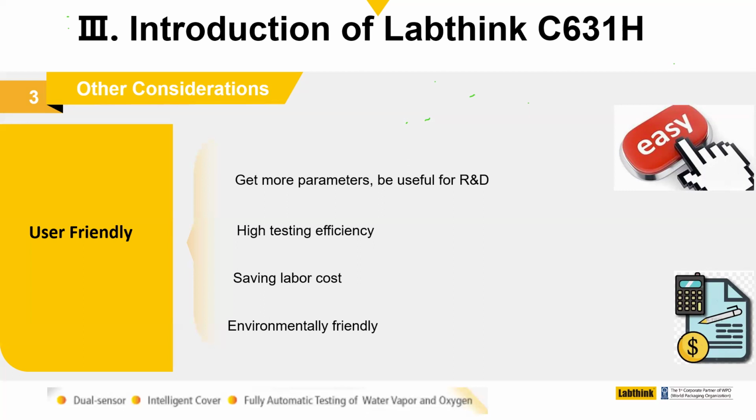So it's very efficient. Not very much labor cost involved, really. It's just the preparation of the specimens, starting the machine and monitoring the results. And as I mentioned, it's environmentally friendly, but more importantly, it's much less of a safety hazard than the oil bath method.